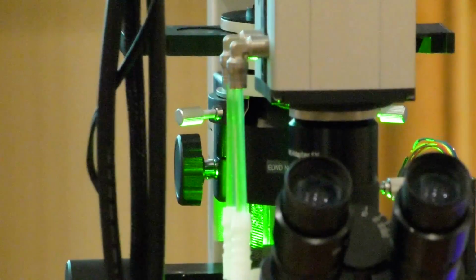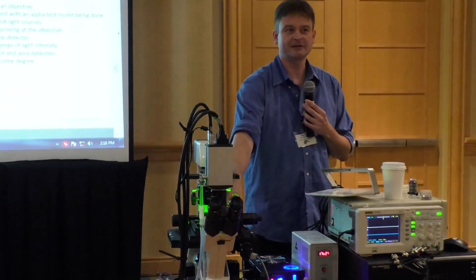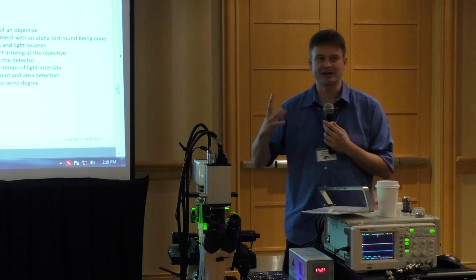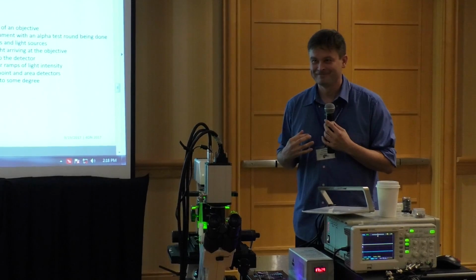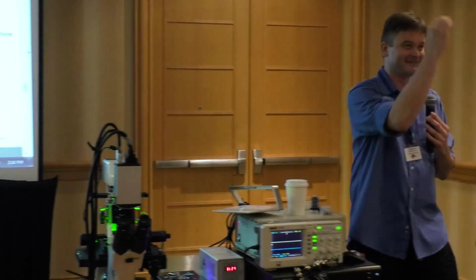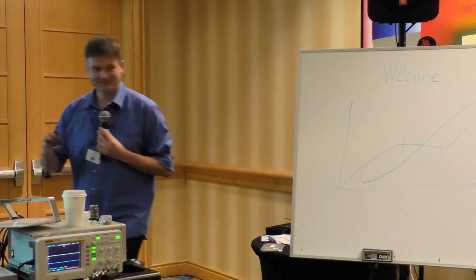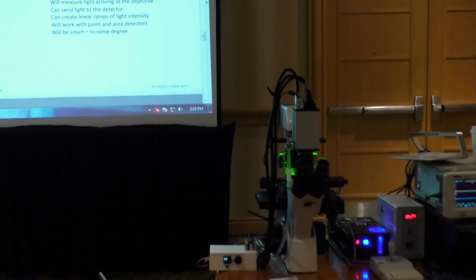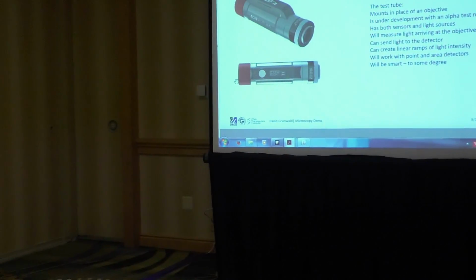No, we want to know here at the sample, at this objective, how much power is going into and through this objective. How much light? I mean, there must be a value for that. Let's measure it. Jörg, please, why don't you come here? We have a power meter head and we have a power meter. Want to get started?